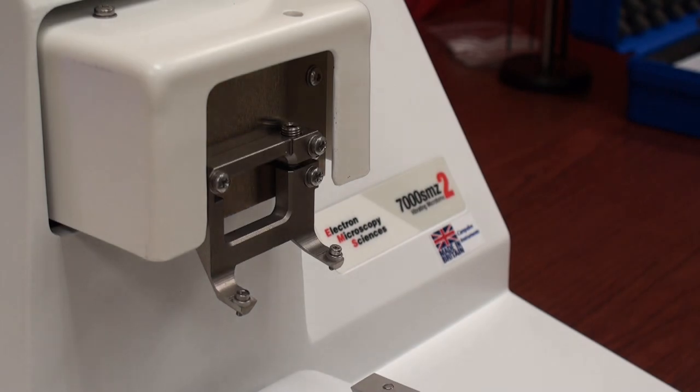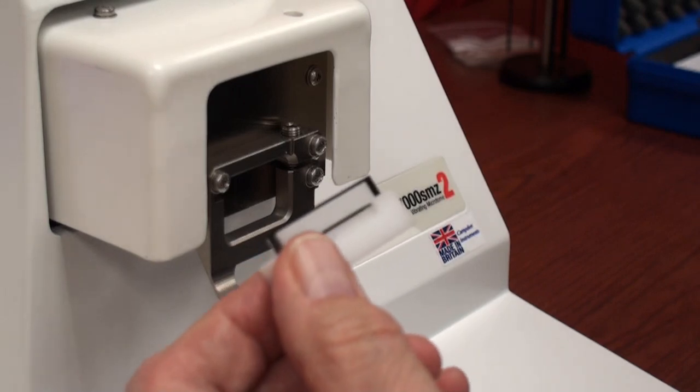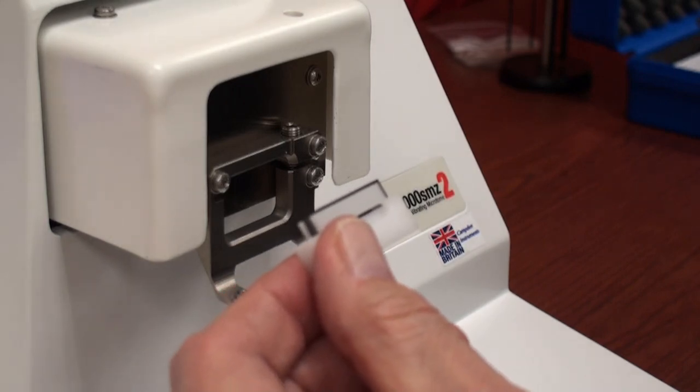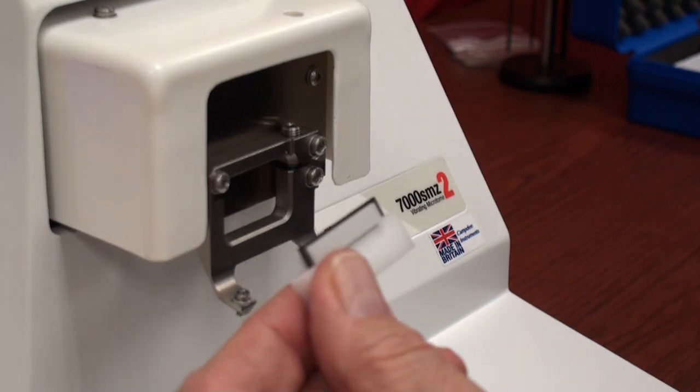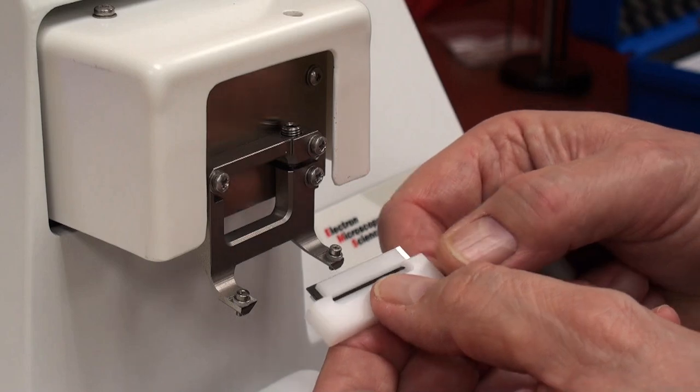Now I'd like to show you how to install a knife in the Tissue Slicer, the 7000SMZ2. Here you see one of the ceramic blades in its protective holder, which prevents you from cutting yourself, which usually will generate some paperwork and some embarrassment.